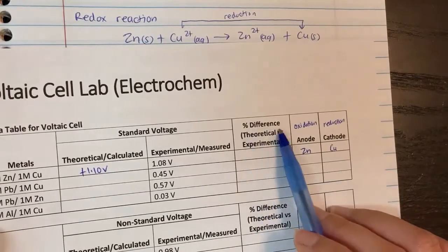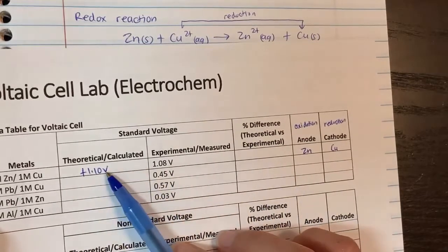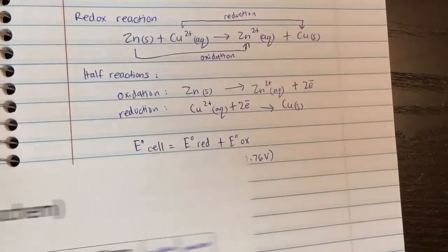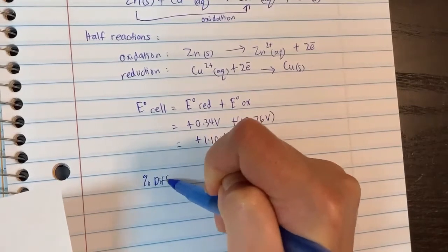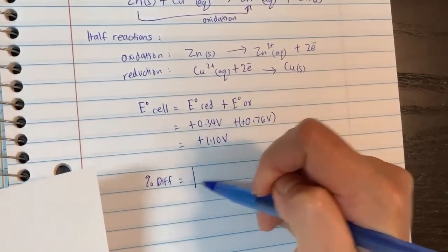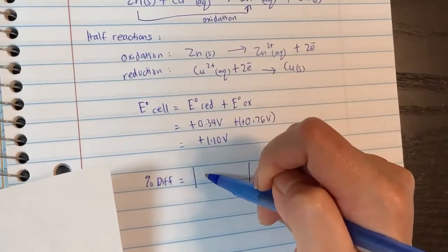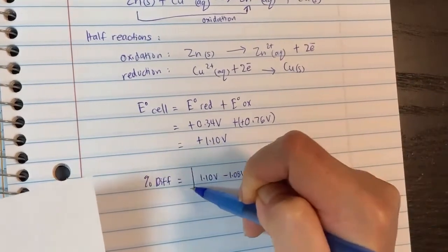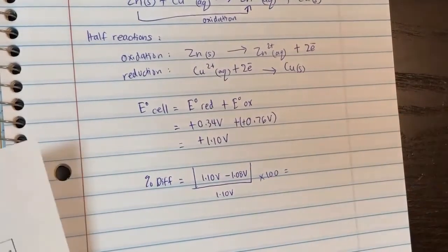To get the percent difference here, all you do is take the difference and divide it by the theoretical times 100. Let's go ahead and try doing that. I'm going to write the calculations on a piece of paper over here. The percent difference for the first one is the absolute value of the theoretical minus the experimental: 1.10 volts minus 1.08 volts, divided by 1.10 volts, times 100. That would give me the percent difference.